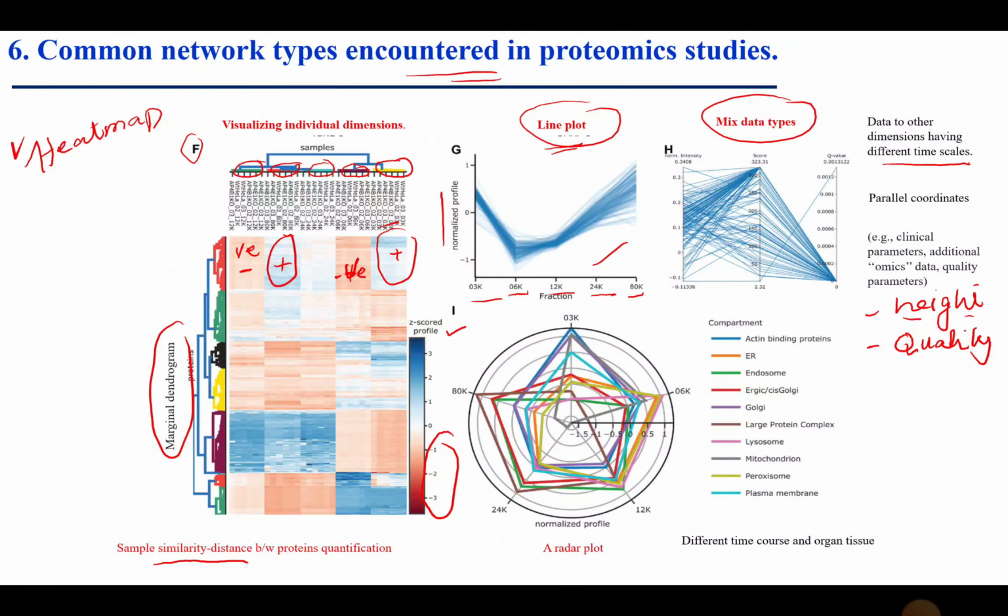So it means that both parameters are not related to each other. Then we need to find a statistic called Q value, and we know that usually Q value is used for finding whether something is a good fit or bad fit.